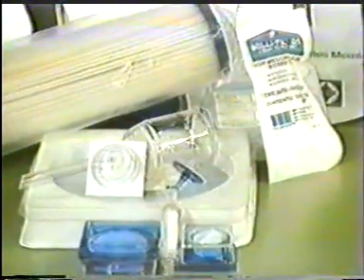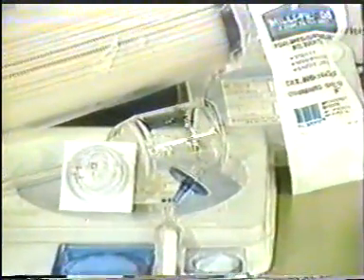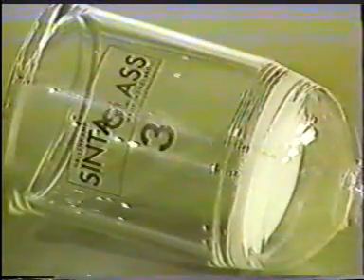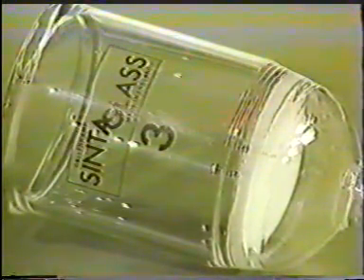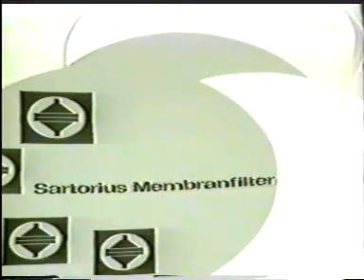Filtering, connected closely with the filling process, is the filtration of the product. Filtration is sometimes used as a method of sterilization, but it is also used to remove particles from products that are to be sterilized by heat. There are various types of filters, including sintered glass and ceramic. The type most commonly used in sterile production is a membrane filter.